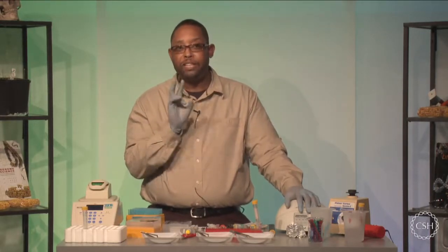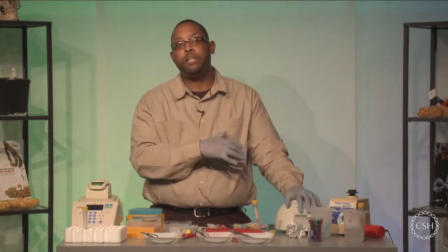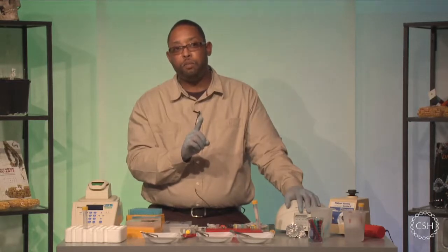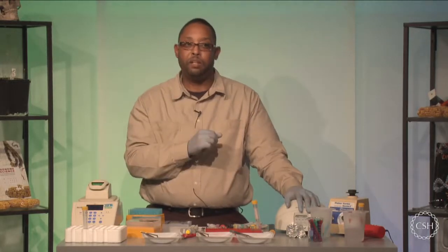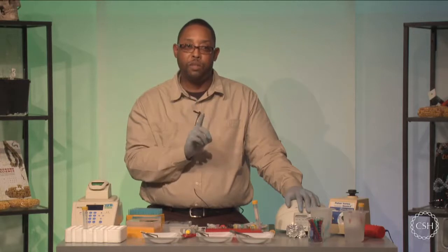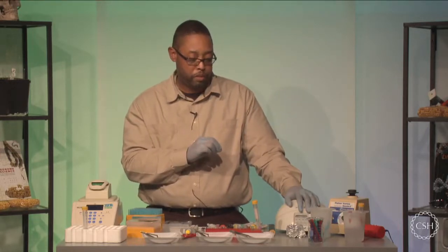It's important that we have these two separate washes because each wash will independently take more contaminants away with it. Doing just one large wash will not do this because it potentially will leave more contaminants around, rather than if you did two washes independently. Okay? So it'll be very important to do two washes and not one single large wash. You get more off with two independent washes.